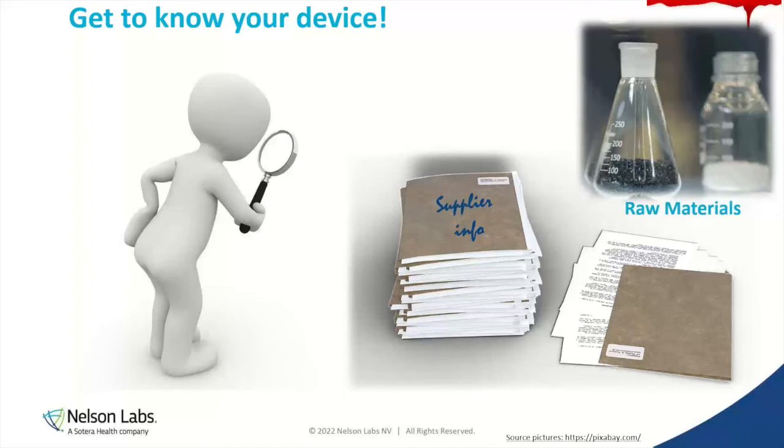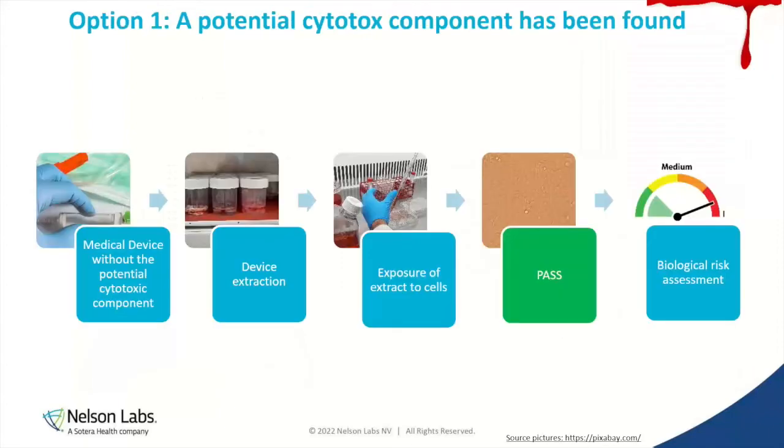Not everybody knows it. I don't know it by heart like Audrey does, but it can be helpful then to ask an expert or material expert to guide you in this. Now, if you have found a potential component of your device that has a potential cytotoxic effect, then you have two options.